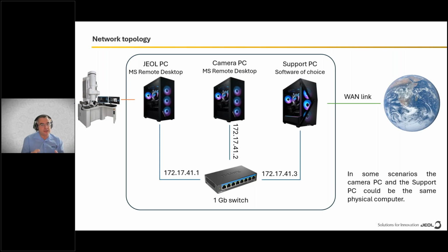How does it do it? It connects via a separate interface to the computer that is run inside the microscope. Considering the scope of today's webinar, I am not going to discuss the computer inside the microscope. We just need to know that there is a board there.